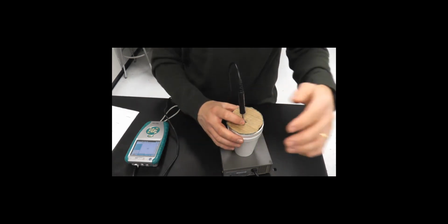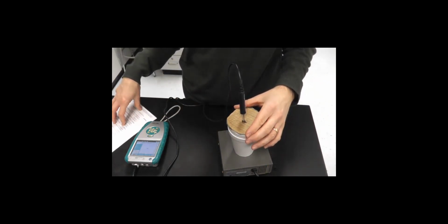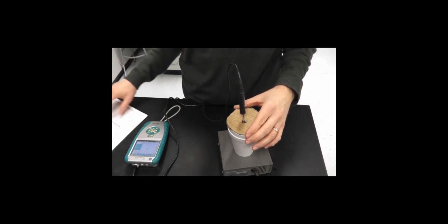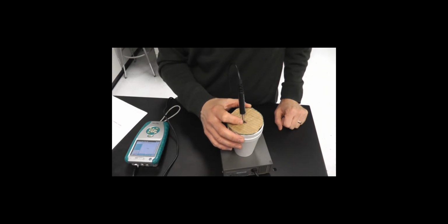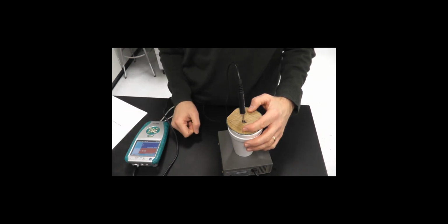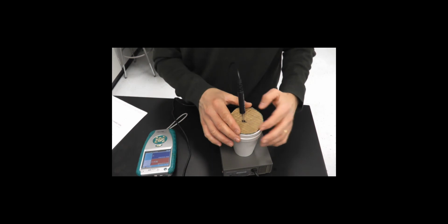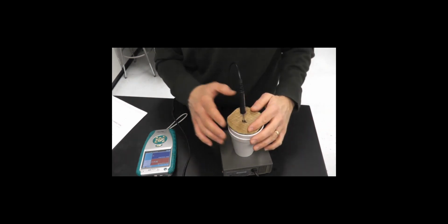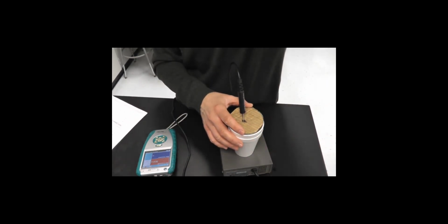All right, so notice that's the rest of part two of the data. What's going to end up happening is I will direct you to your data, and I'll talk a little bit about the data and tell you what calculations to skip and which ones not to skip, all right? But that's pretty much it. So you can see our temperature is up to 32.6, so fairly exothermic when these two things react. Again, one was 19 when we started, and one was 21.3, so they warm up pretty quickly. I'll record this for another 3 minutes, but you get the gist of what's happening.